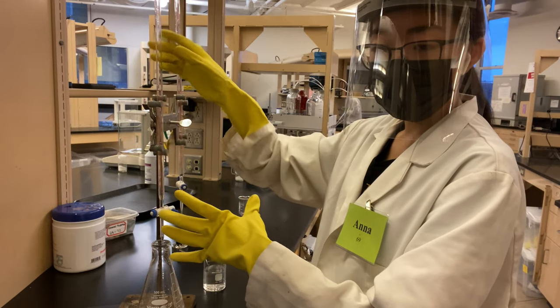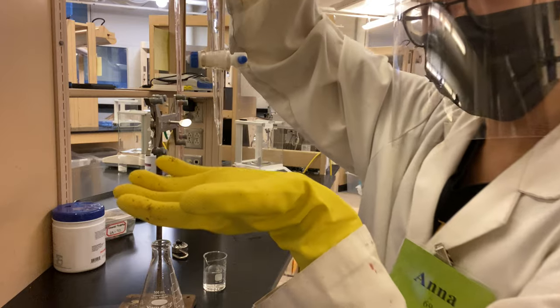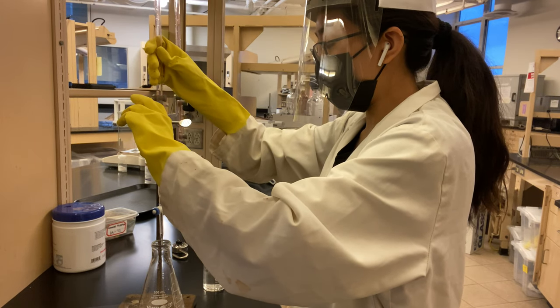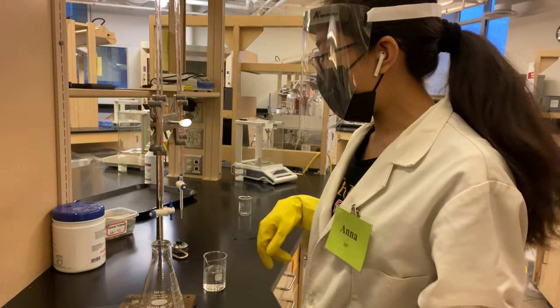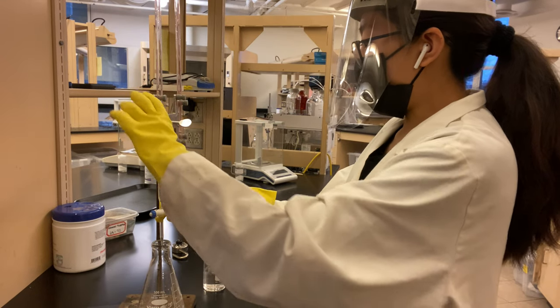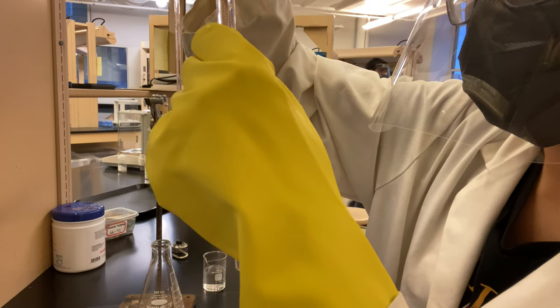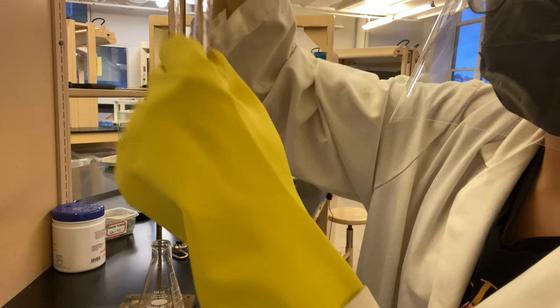So then we are going to show the tip and confirm that there are no bubbles, so the reading is accurate. Okay, and then we are going to show the tip and confirm that there are no bubbles. Okay. And then our reading is — the meniscus is at about 20.65 mL.